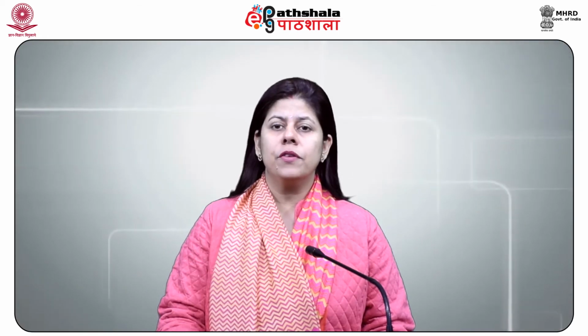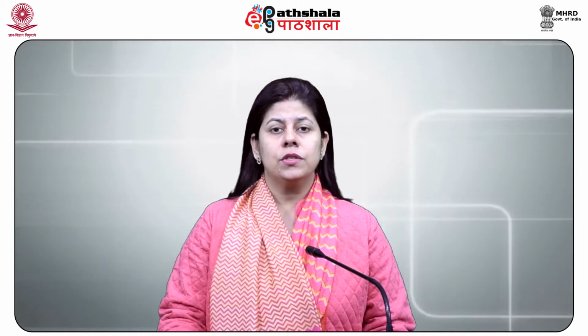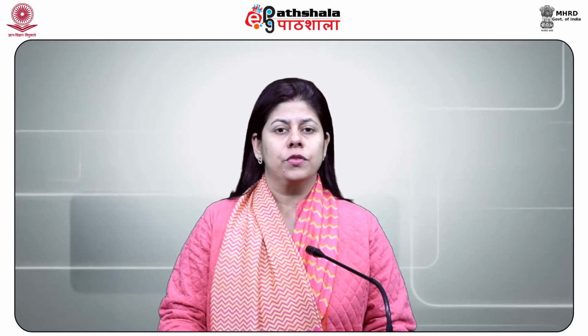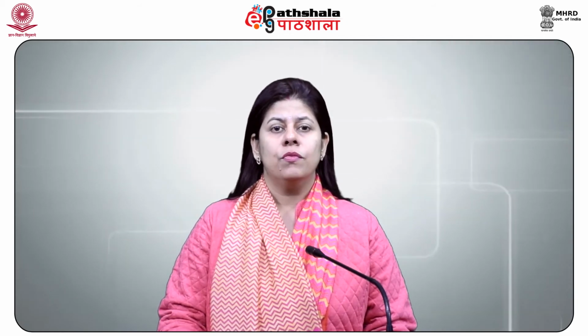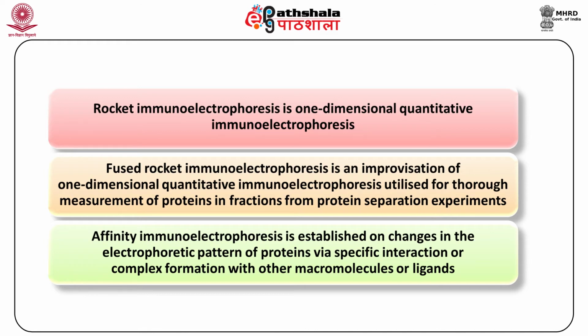Immunoelectrophoresis. It is a common name for several biochemical methods for isolation and characterization of proteins on the basis of electrophoresis and reaction with antibodies. All types of immunoelectrophoresis need immunoglobulins, the antibodies which react with the protein, to be isolated or characterized. Rocket immunoelectrophoresis is one-dimensional quantitative immunoelectrophoresis. Fused rocket immunoelectrophoresis is an improvisation of it, utilized for thorough measurement of proteins in fractions from protein separation experiments. Affinity immunoelectrophoresis is established on changes in the electrophoretic pattern of protein via specific interaction or complex formation with other macromolecules or ligands.